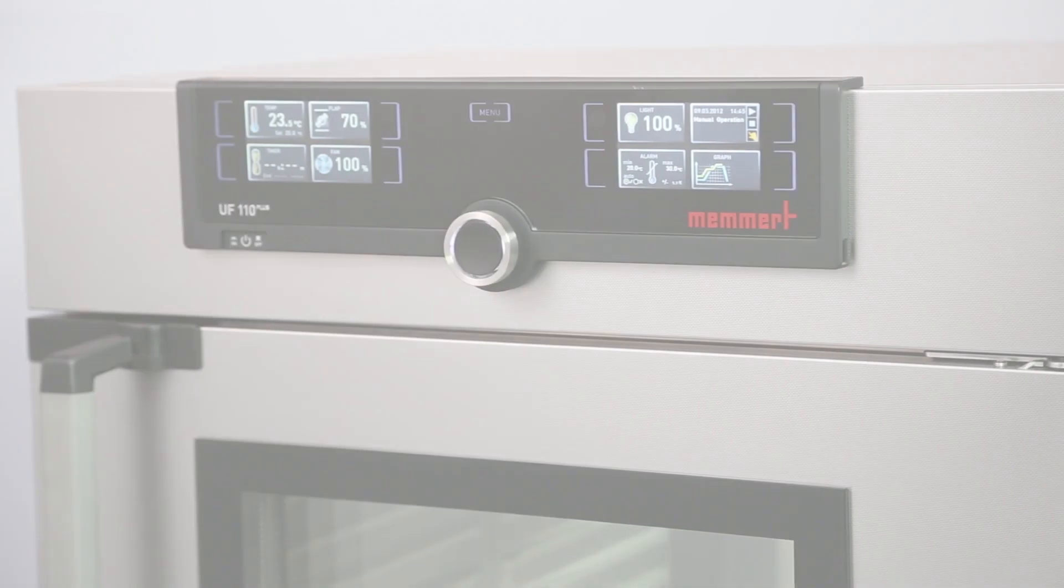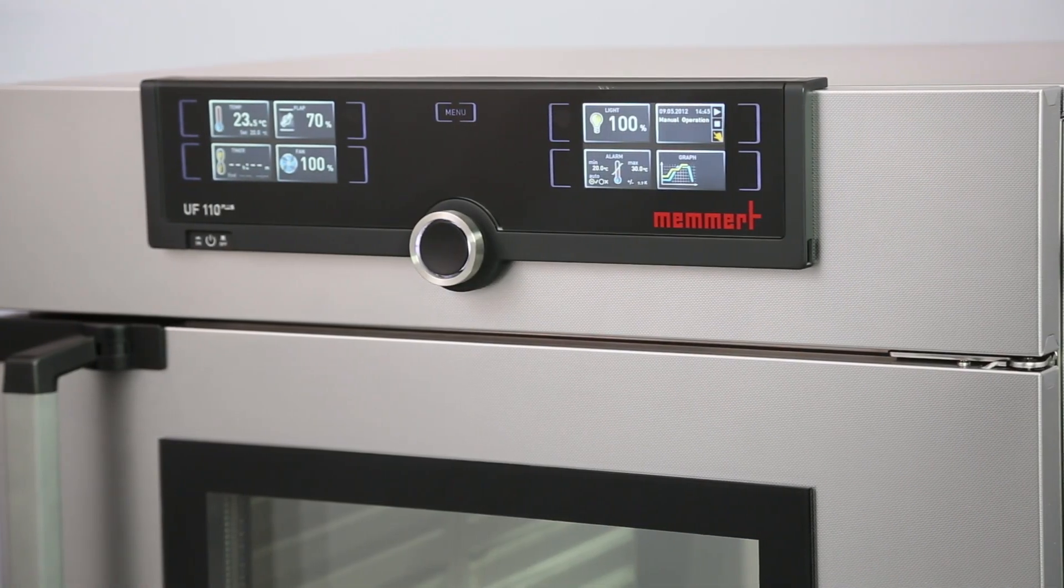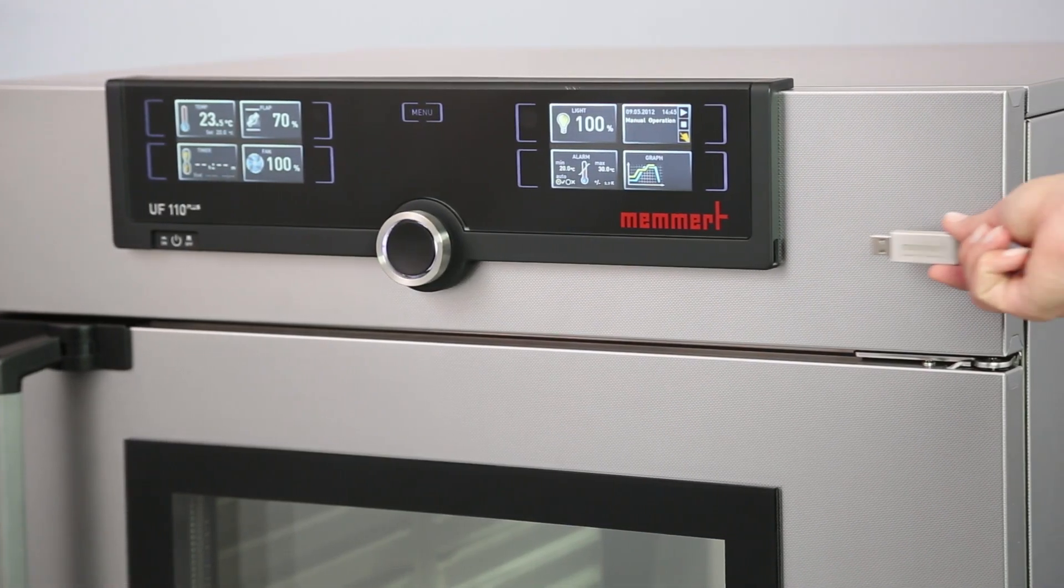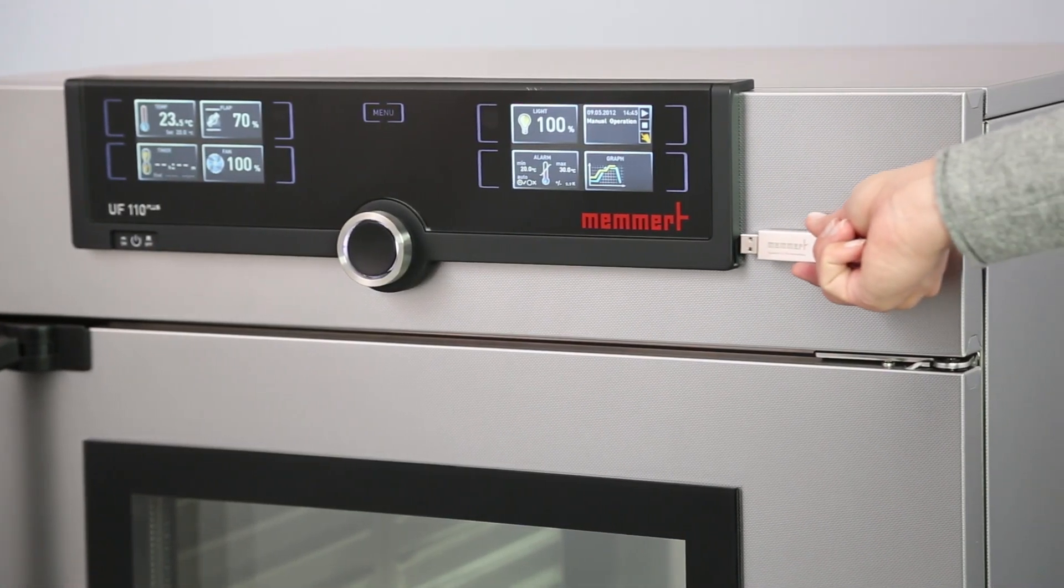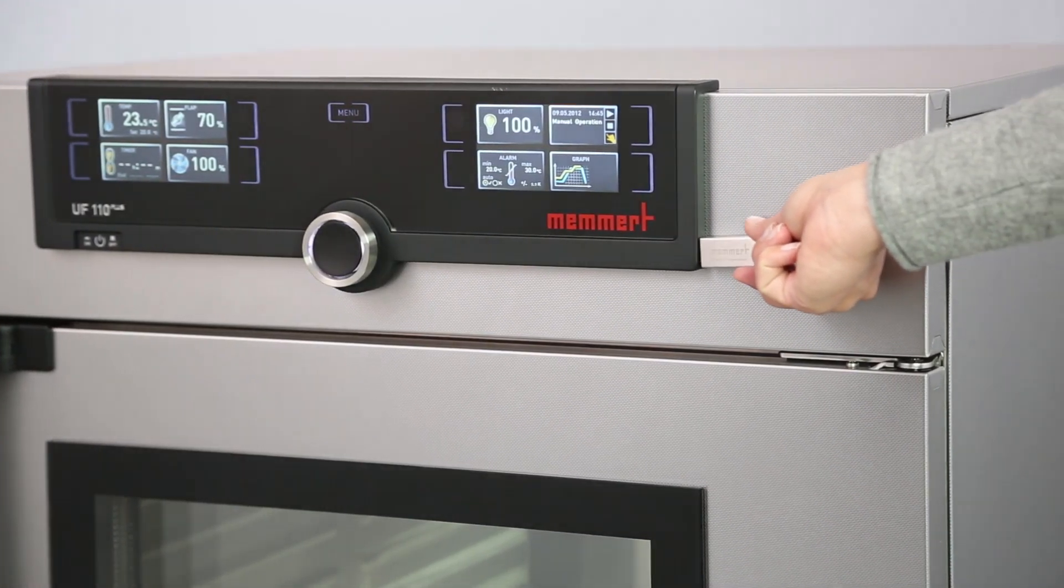When your profile is completely programmed, simply upload it via USB stick or ethernet connection.